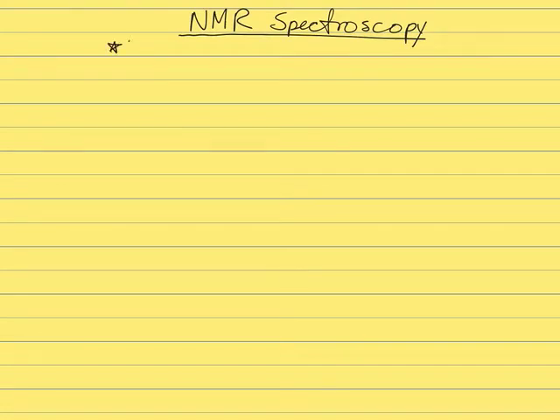In this video lecture, I'm going to go over the concept of NMR spectroscopy. NMR spectroscopy is different from all of the other types of spectroscopy that we've learned about for a few reasons. First of all, it uses the magnetic portion of electromagnetic radiation. Every other type of spectroscopy that we've looked at so far has used the electric part of electromagnetic radiation, and NMR is based on the magnetic component.